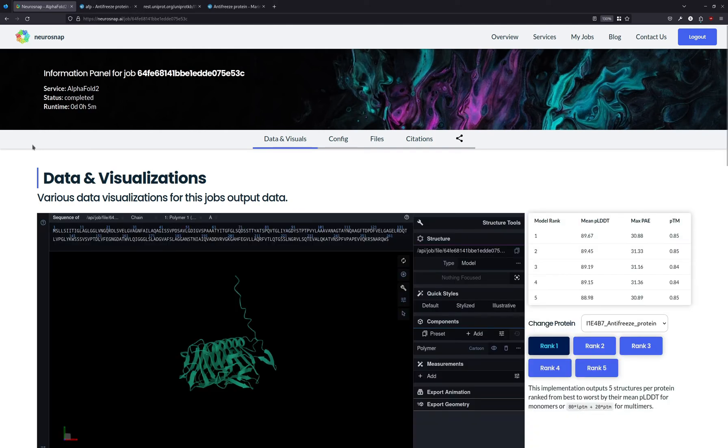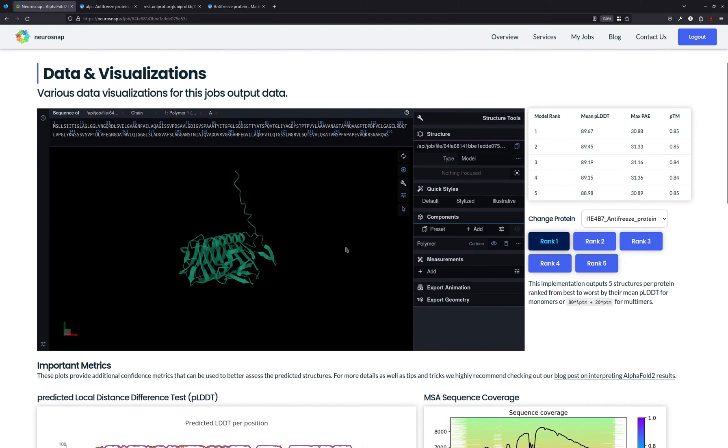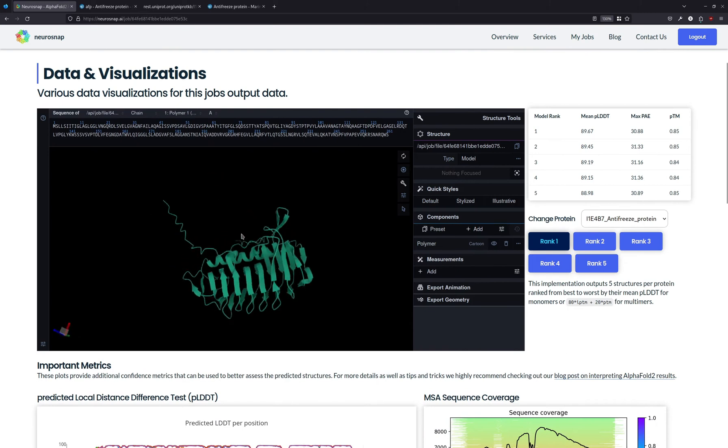All right, so here we have the results. As we can see, it took about 5 minutes. This is, after all, a pretty small protein, just over 250 amino acids, so it shouldn't take too long. And the structure looks very good.